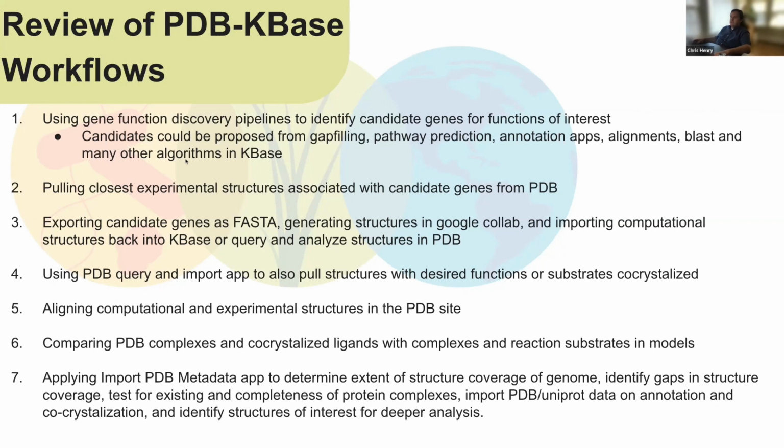The thing I envision is you'll find structures of interest, you'll get the sequences, you'll fold them, you'll put them in KBase just for documentation, but then you take them to the PDB site and you do these alignments. And then the idea is you would screenshot these and put them in your KBase narrative to help document the science you're trying to do. So KBase is, in a lot of ways, an analysis pipeline, a data compilation and sharing pipeline, but it's also a publication pipeline.